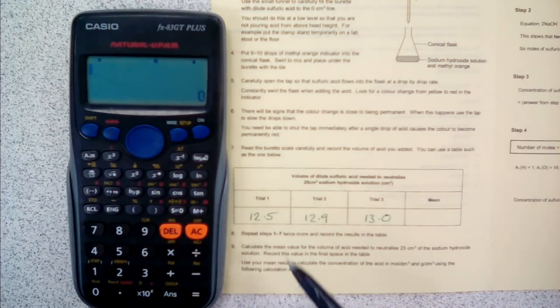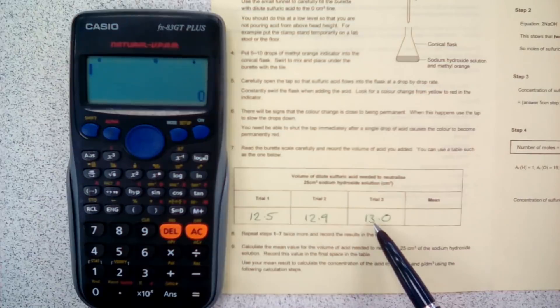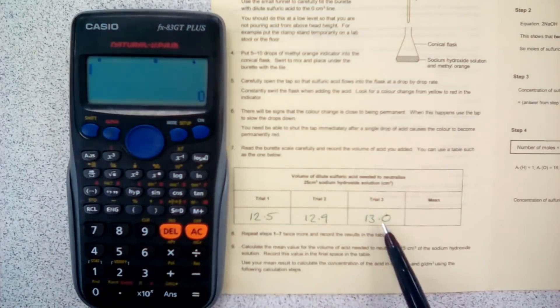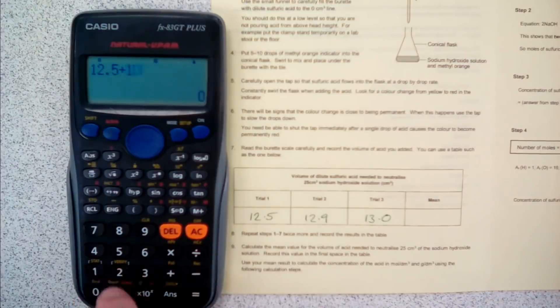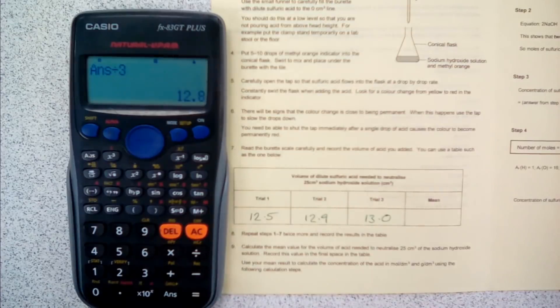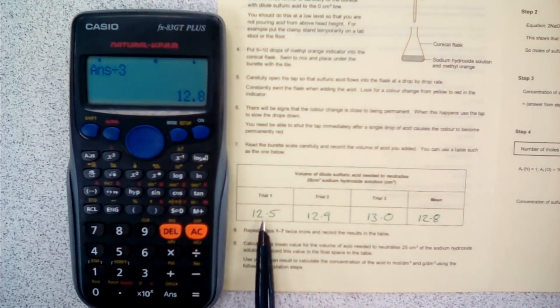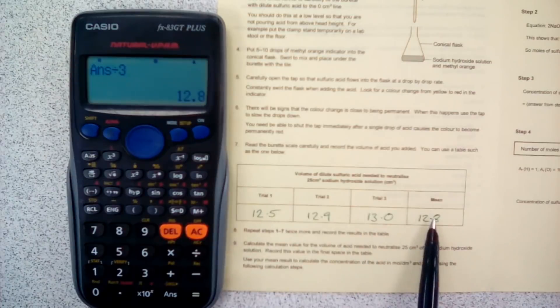Here we have our three results from the titration: 12.5 centimeters cubed, 12.9 centimeters cubed, and 13.0 centimeters cubed. We now need to calculate the mean. To do that we have to add up these three and then divide the answer by three. On our calculator: 12.5 plus 12.9 plus 13, then press equals, and then divide by three, otherwise you'll get the wrong answer. Our mean is 12.8. We can do a sanity check: 12.5 is the lowest, 13 is the highest, so our mean should be somewhere between those two. 12.8 is between 12.5 and 13, that looks like a right mean.